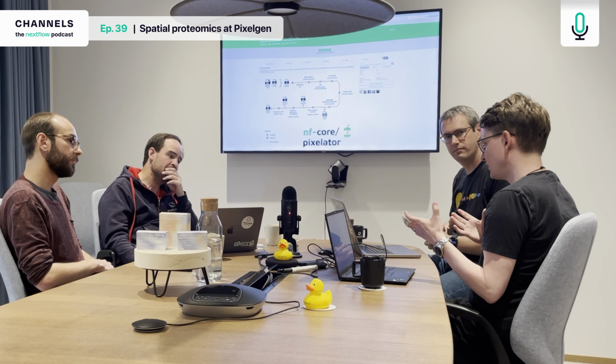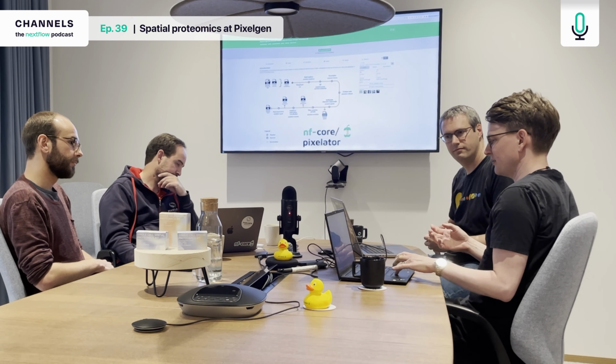But you have no regrets at this point. People are able to run the Nextflow pipeline on their infrastructure. Yeah, and I think that goes back a lot to what Florian was saying. When we work within this framework, a lot of institutions already have the Nextflow infrastructure, or even the NF Core infrastructure, set up.